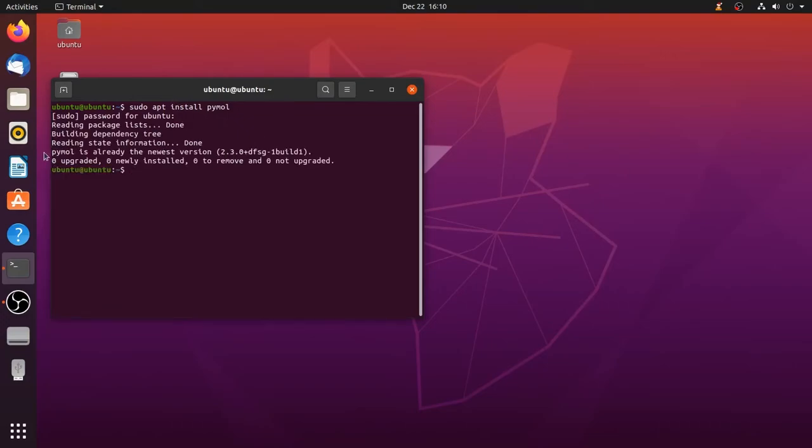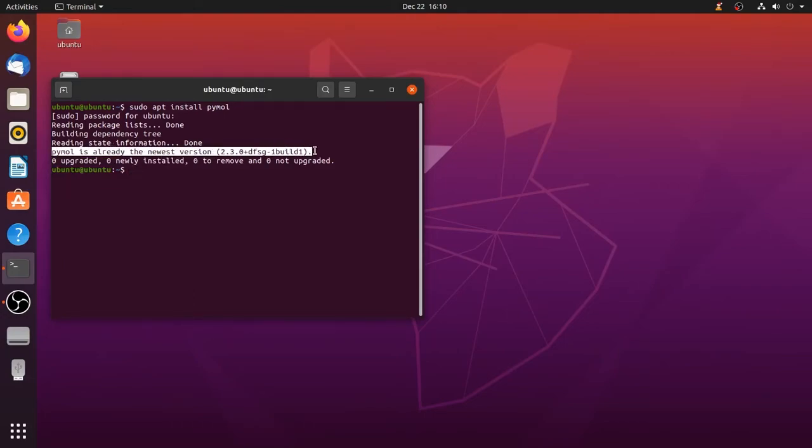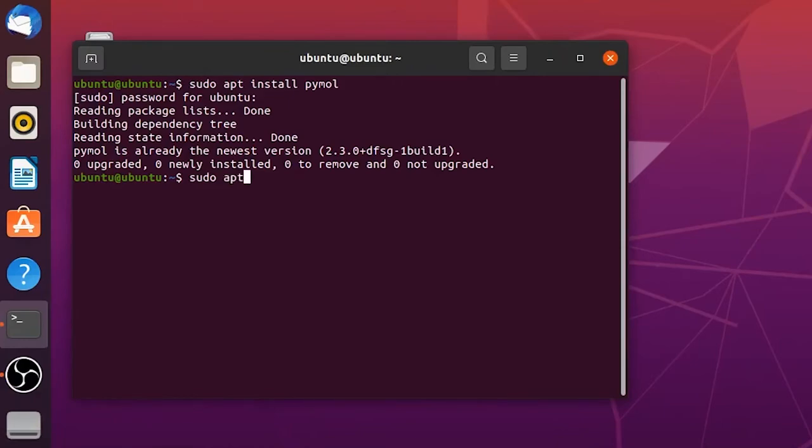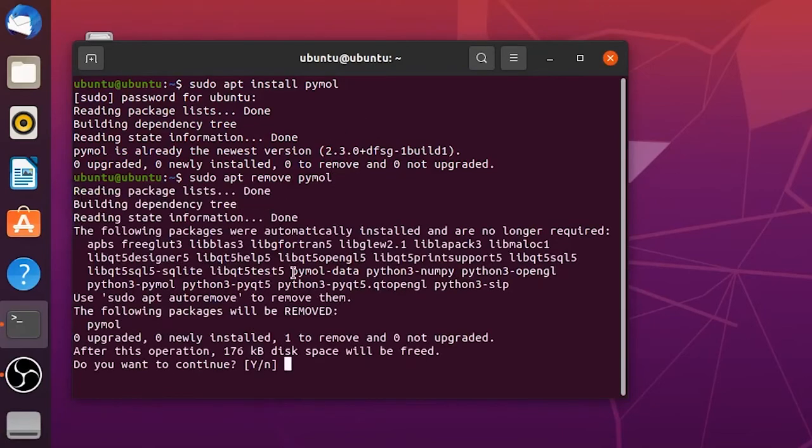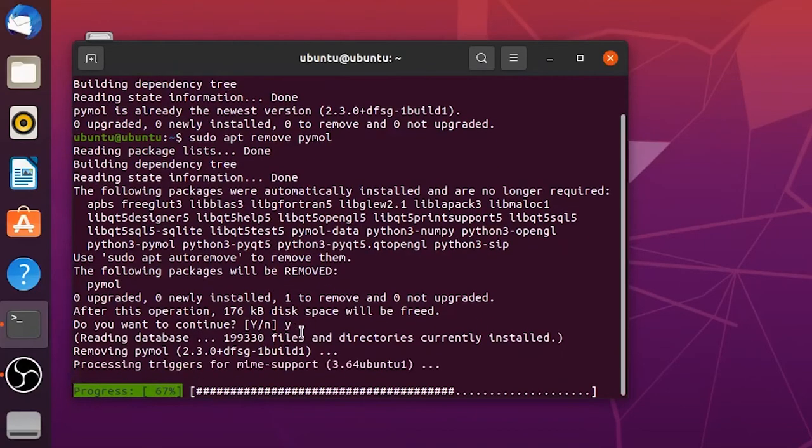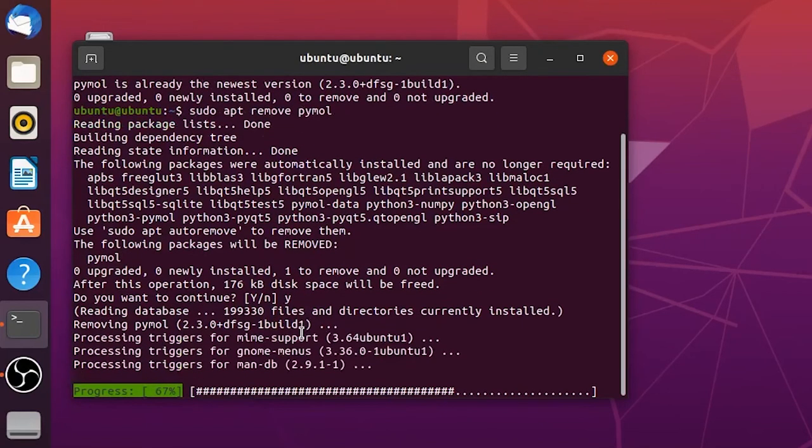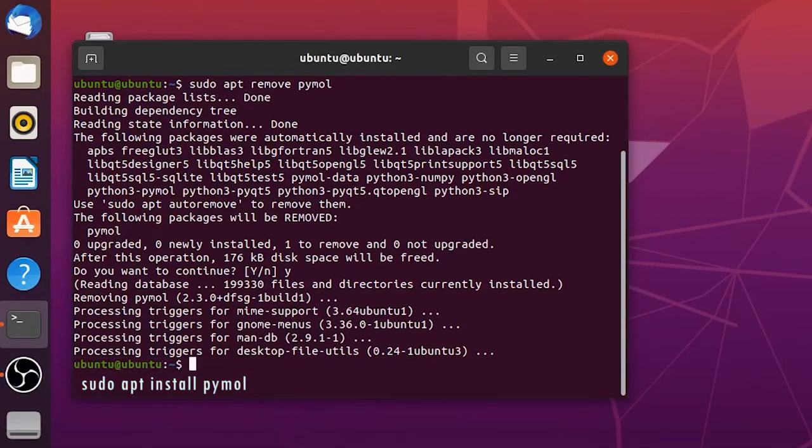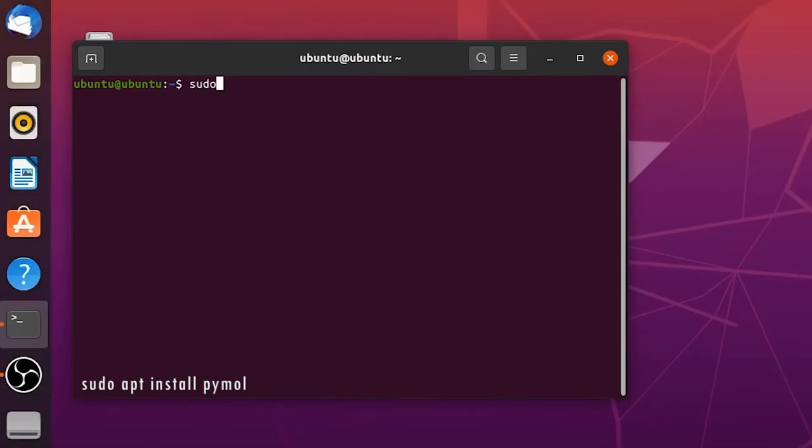In this system PyMOL is already installed so now I am going to remove PyMOL from this system. To install it again type the same command sudo apt install pymol. This will install PyMOL, it is very easy.